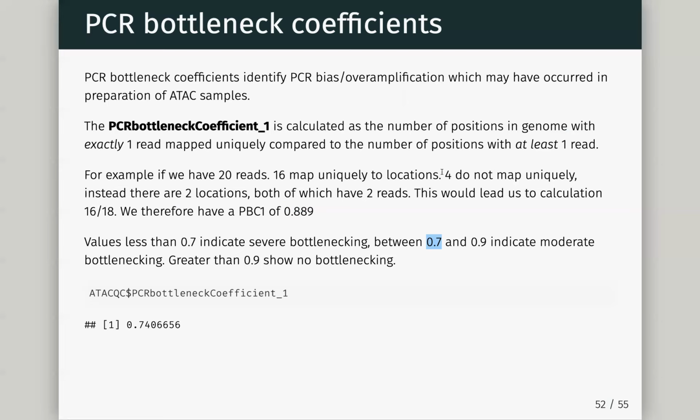You'll just say it's acceptable at that level. So there's not much cleaning up you can do. I mean, people have tried methods for removing duplicate reads. The issue with duplicate reads, and me and my old boss wrote a paper on this, which is still contentious now, but I think generally accepted, is that once you get enough sequencing depth, you start to get duplicates which are real. So removing duplicates can be a really dangerous thing.